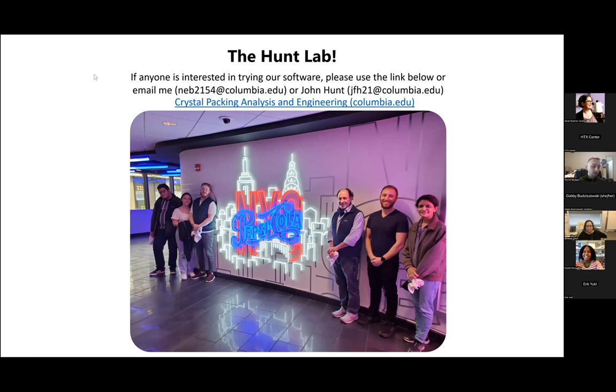it makes more crystal packing contacts on average in the engineered construct versus the native construct. And I think that's just because the protein in the engineered construct would reorientate itself such that the arginines just maximize the number of contacts they would make. And I think just natively that follows that if you can make a crystal packing contact, you will if you're in a good environment to do so. As opposed to the diffraction quality, from what I understand, it was the same, but I would need to confirm that. Okay, that's great. Thank you for a wonderful talk.